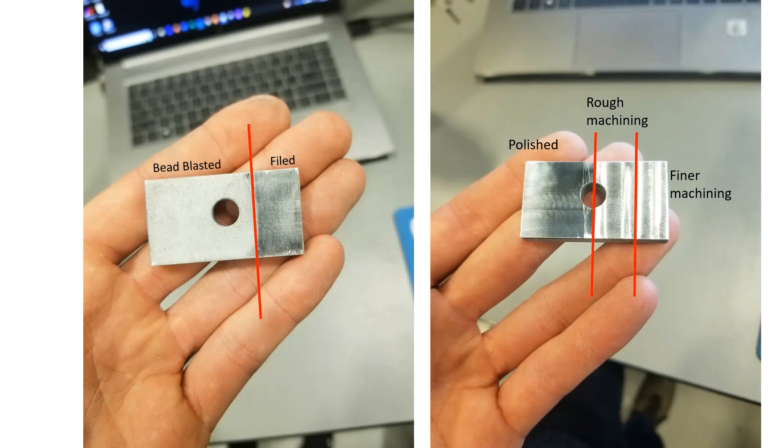One side I bead blasted the surface with fairly coarse media and then used a fine file on a section of that same side. On the other side I did rough machining, then sanded and polished half of it, and then did some finer machining on the other edge. I will discuss these surface finishes in more detail later with accompanying SEM images.